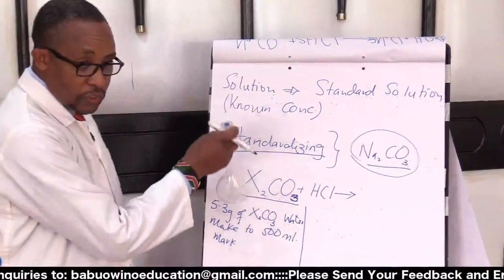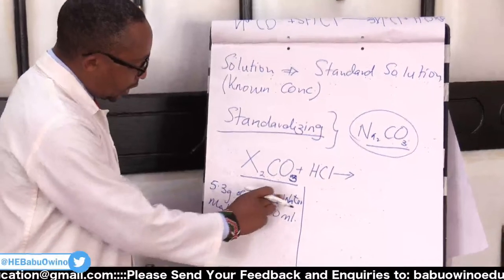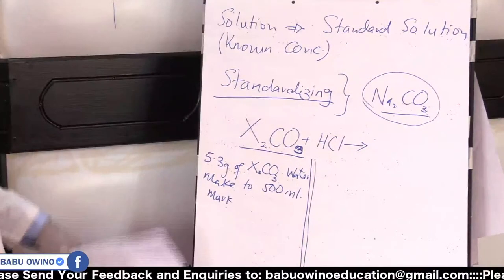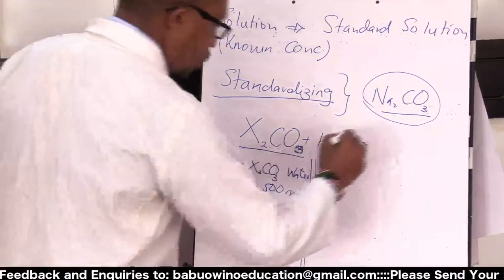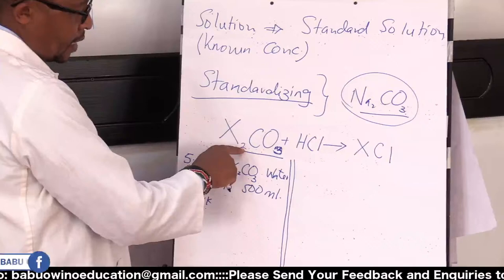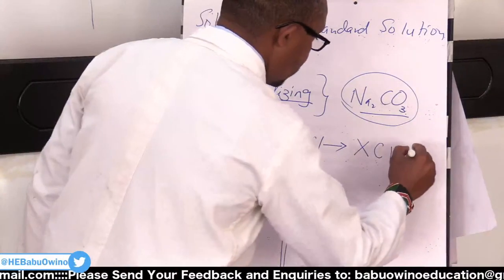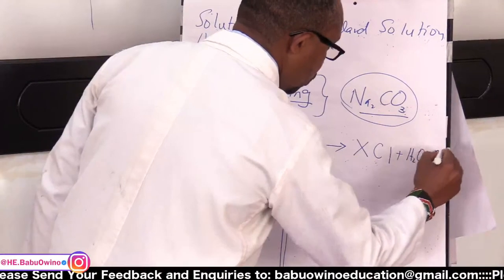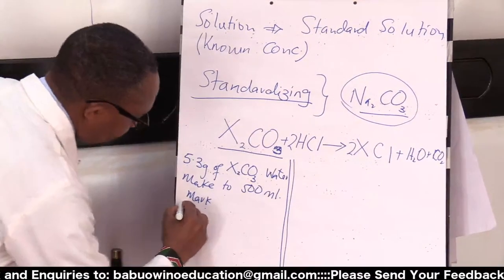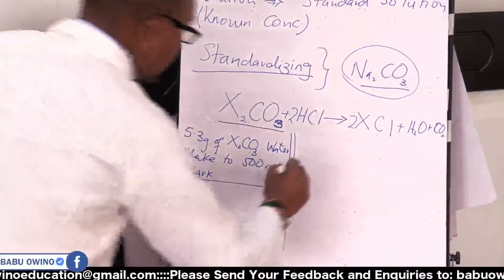Now, we could be given the same question, but differently. We are saying 5.3 grams dissolved in 500 mls, and we are reacting it with HCl. So what would be the equation? X combining with this, XCl. Looking at this, the charge of X is 1, it is monovalent, plus water, plus CO2. So if I balance my equation, that is what I get. This is what is in the burette.